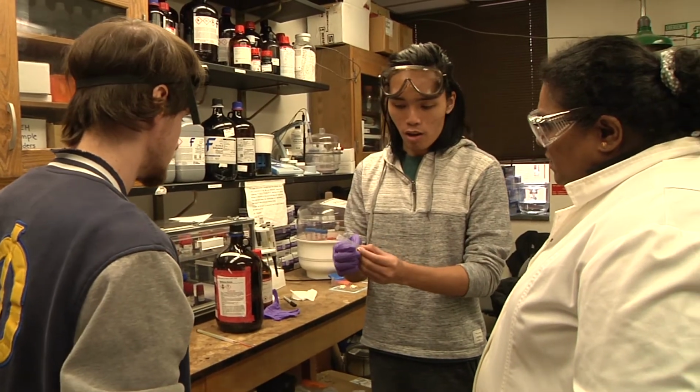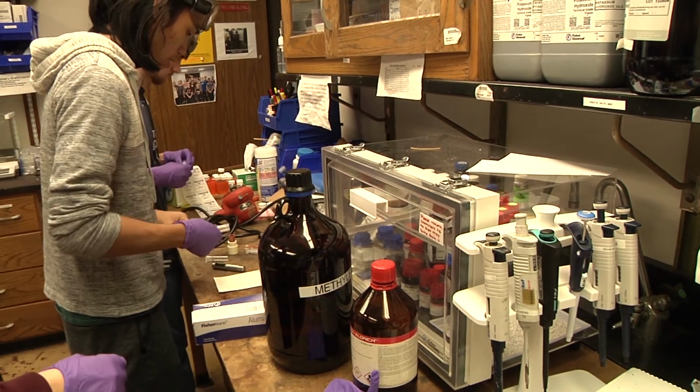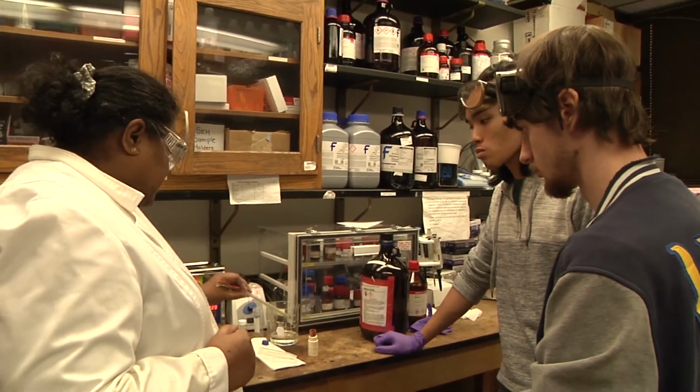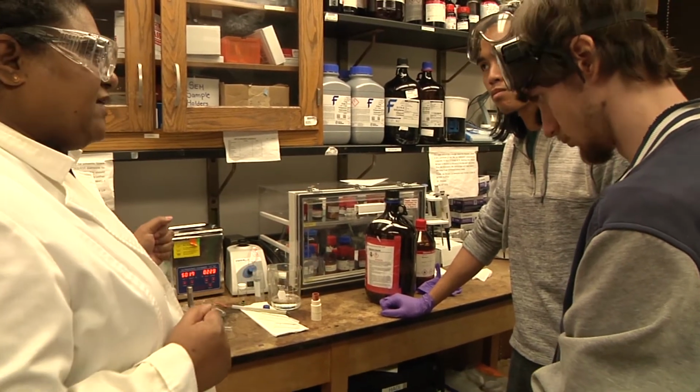I'm currently researching the electrochemical characteristics of organic and water-soluble gold nanoparticles. We want to see the oxidation reduction potentials in different gold nanoparticles dependent on the ligands that are surrounding the gold cores, and we want to see the electron transfer between these two. These have direct applications to solar fuel cells, and it also increases the characteristics of a capacitor.